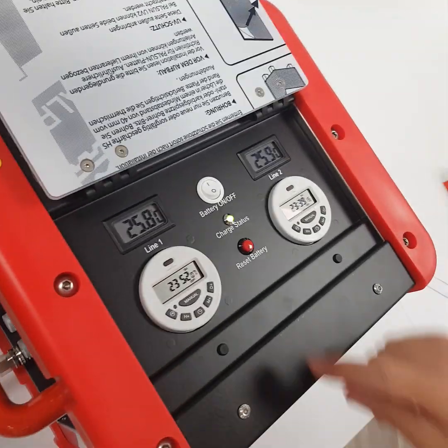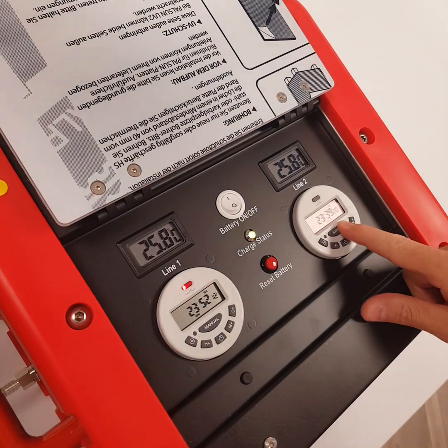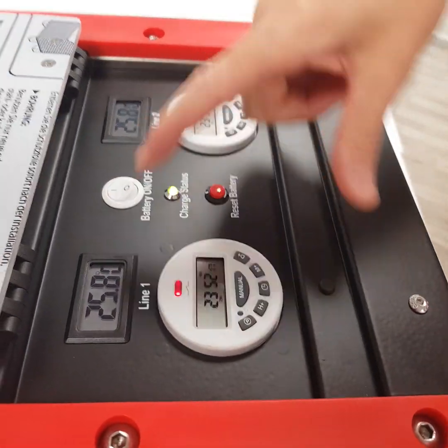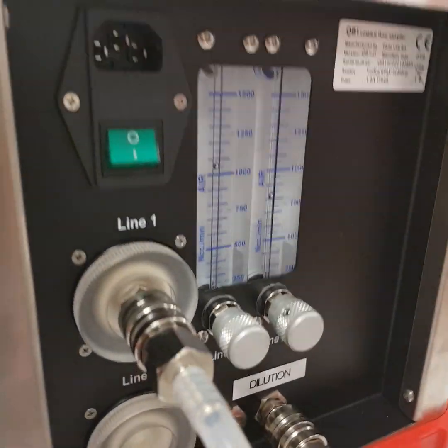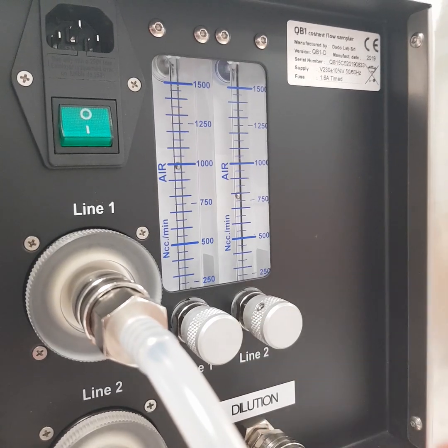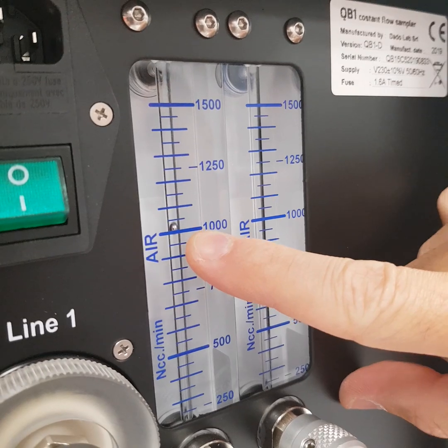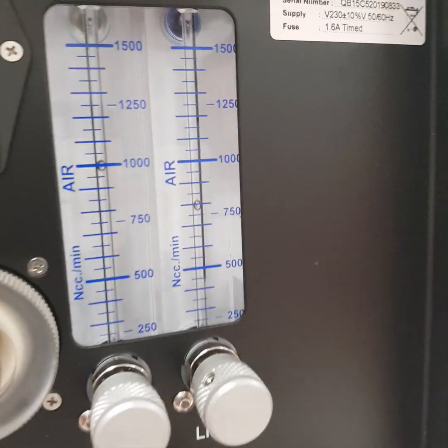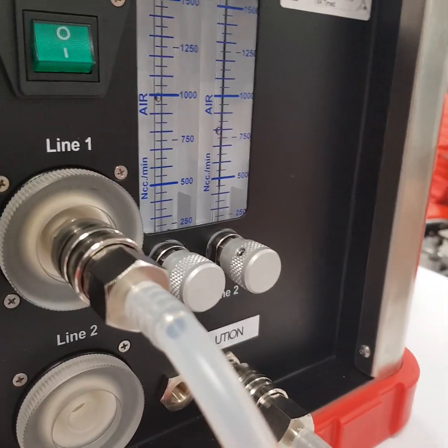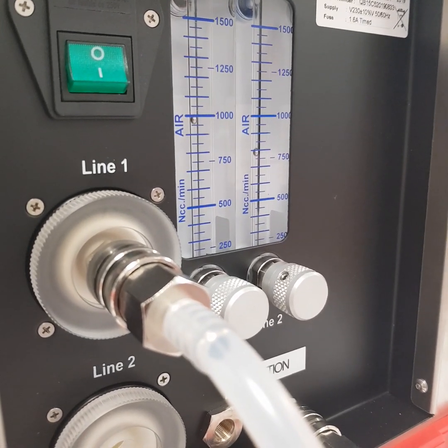We have to make the pump start. We can make the first one start and then the other one. Please check line one and line two, and then we can adjust the flow meter with these two. In this case we will have a total amount of flow of about one liter and then dilution 0.8, giving us a one-to-four dilution ratio.